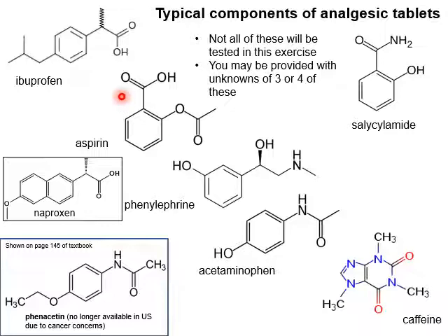Now on to your experiment. Given four analgesics, ibuprofen, naproxen, aspirin, and acetaminophen, we would give you tablets, for example, or already made solutions, pre-made, and you would spot TLC plates with these, and based on their elution patterns, you would then decide which ones are which, right? So is ibuprofen polar or not?